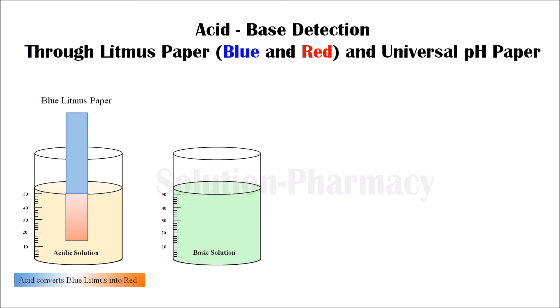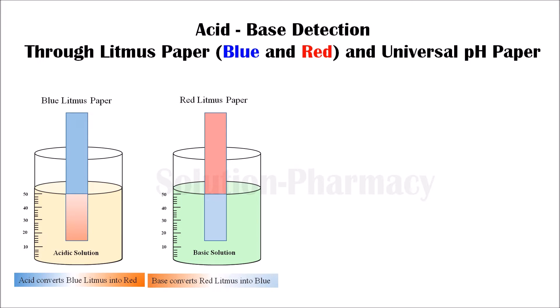Now let's take another solution in a beaker. Dip red litmus paper into it — if the red litmus paper changes to blue, it means our solution is basic in nature, because base converts red litmus to blue. Here you can see the red litmus paper changes to blue in color, which confirms that our solution is basic in nature.